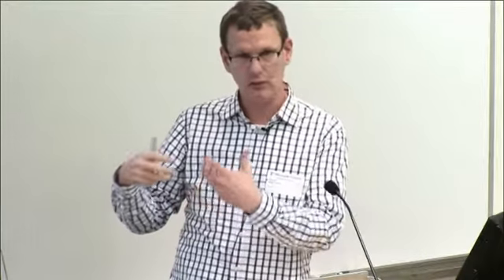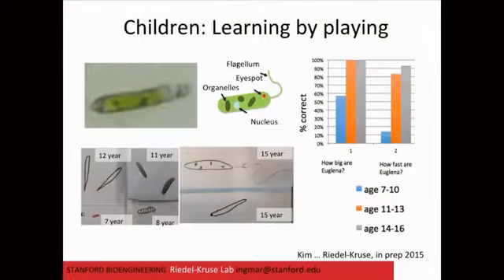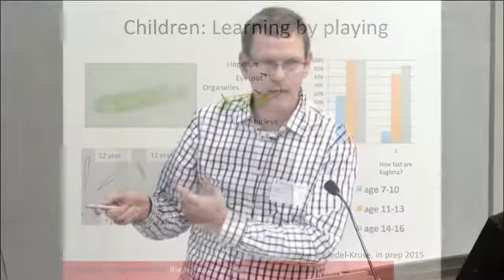And as I will show you in the next few slides, there are three modalities of learning or education that we have in here. One is you can build the system yourself, you can do inquiry by really doing experiments, or you can just play, right? So we tested this with a number of children at science fairs, and here you see different age groups, what they get out of it when they draw. And you see, for example, this 8-year-old drawing little legs on it, which these cells don't have, but clearly reflecting that the child realizes this is something living, right?